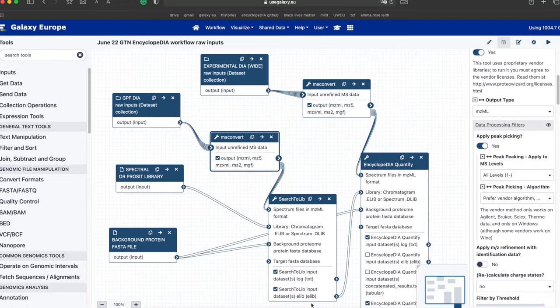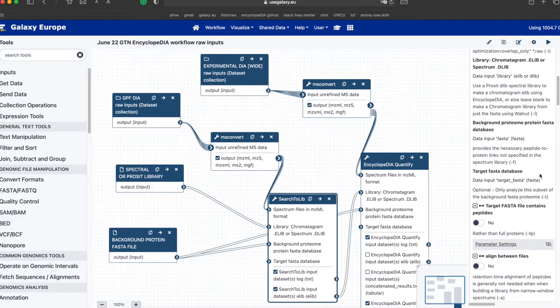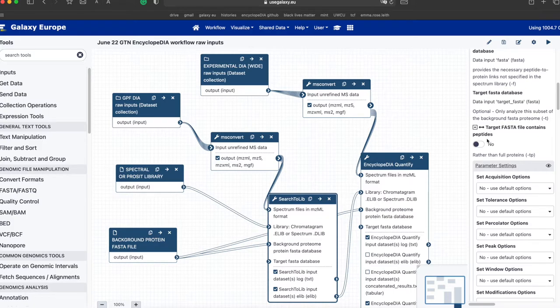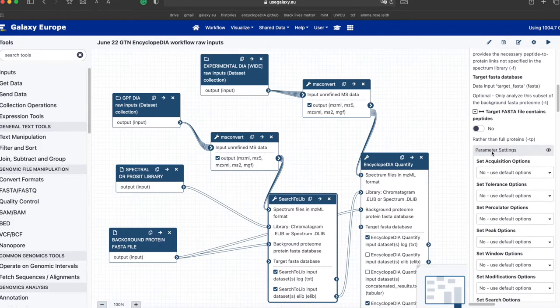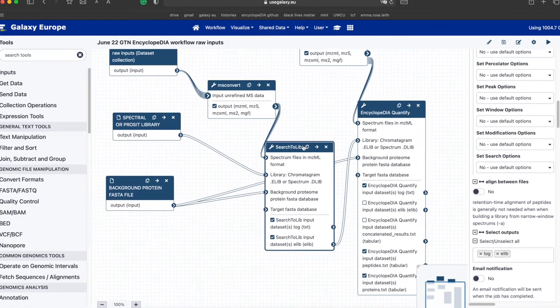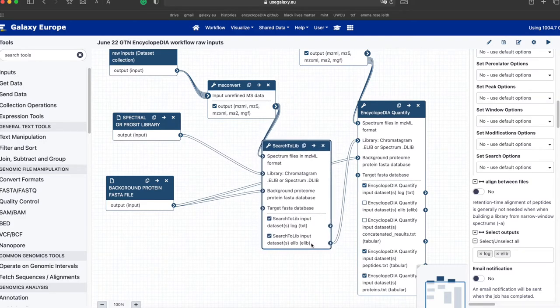Let's take a look at the Search2LIB parameters the same way that we did with msconvert. As you can see in Search2LIB, going into the parameter settings, all of the settings are either toggled to no or we use the default parameter options. Additionally, you can see in this Search2LIB box that an input dataset log text file is also generated. However, as we are mainly focusing on the .elib chromatogram library, this is the emphasized file that is output.